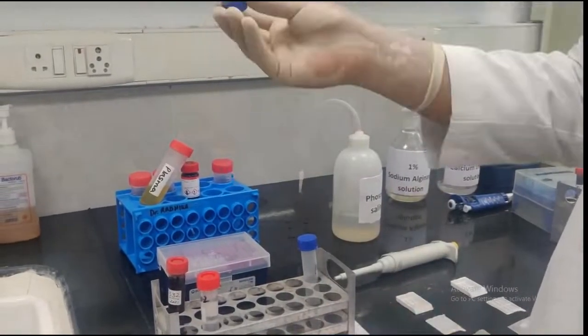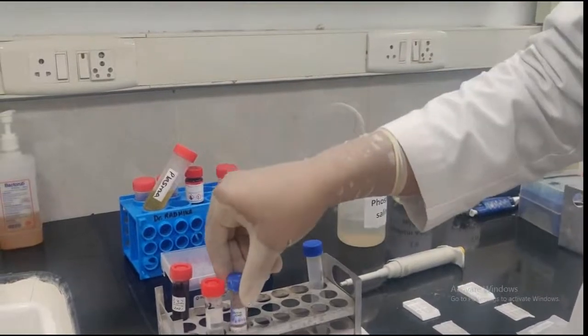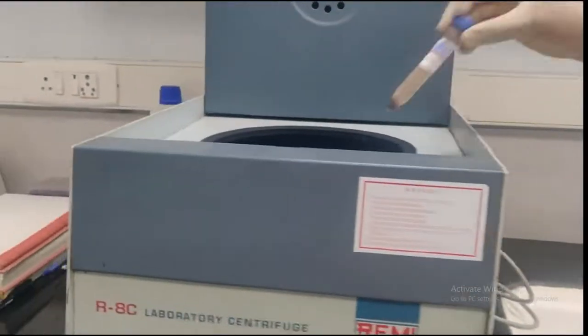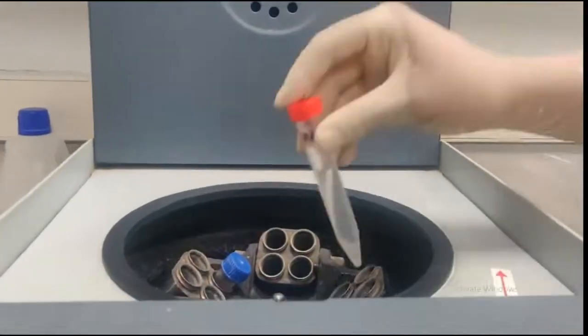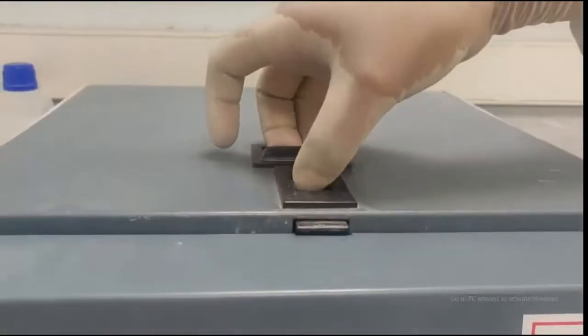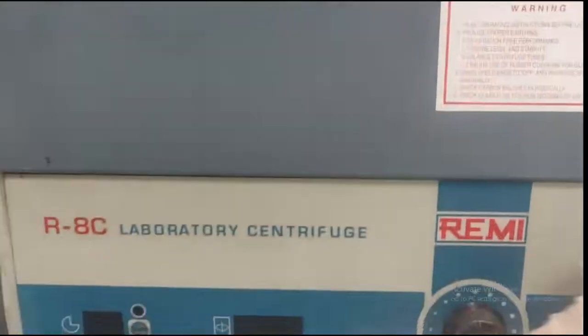So this washing step has to be done thrice. Now these tubes will go into the centrifuge, and we will again centrifuge them at 1500 revolutions per minute for 10 minutes or 3000 RPM for 5 minutes.